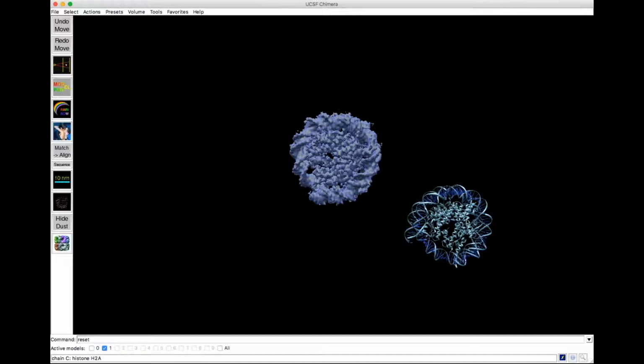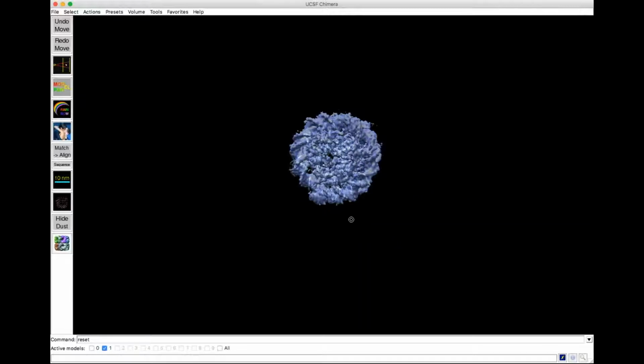And then with the Magic Mouse, what you need to do to move it is press Option and then left click and hold, and you can drag the molecule with that. On a 3-button mouse like mine that has the scroll wheel, you press down on the scroll wheel and it's much nicer. But I'll move that over and get it lined up.